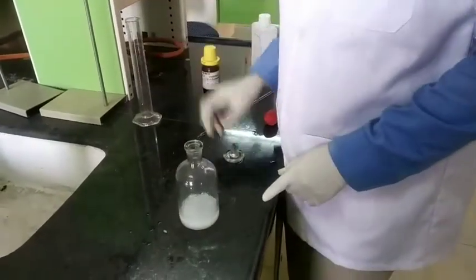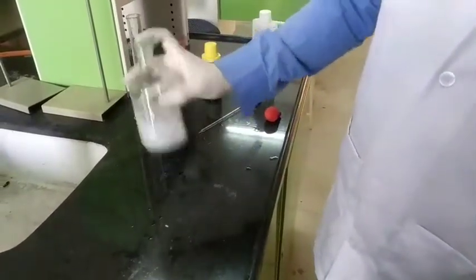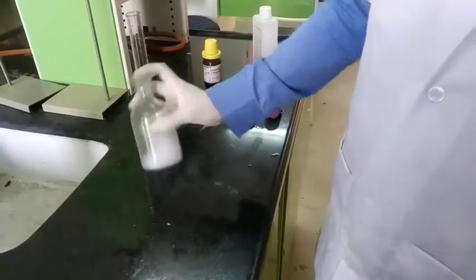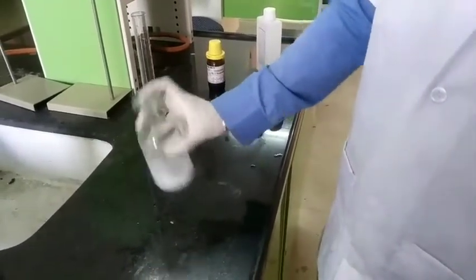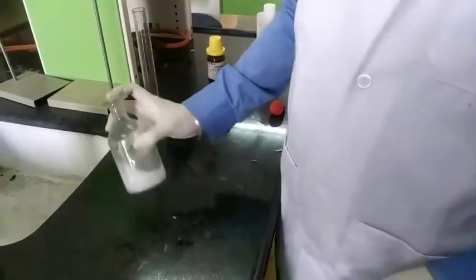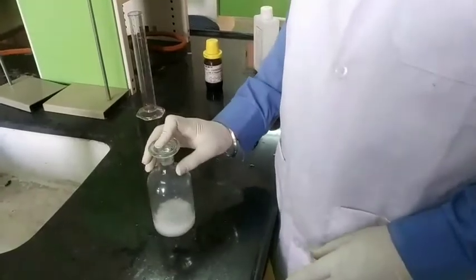Now here you can see the difference in color. Now we will shake it vigorously. It is necessary to shake vigorously after each addition. Now we will add 5 gram of sterilized purified talc, and then we will shake it again.